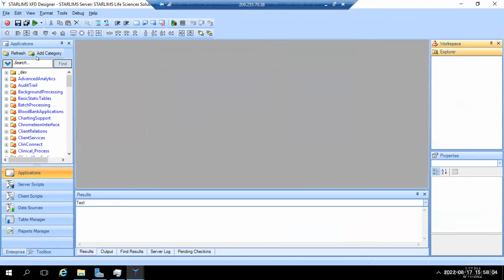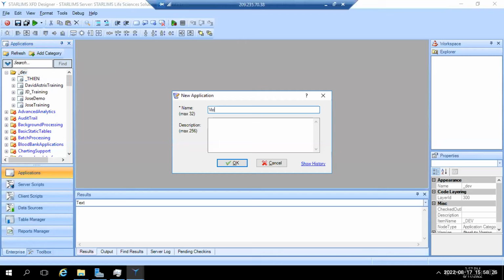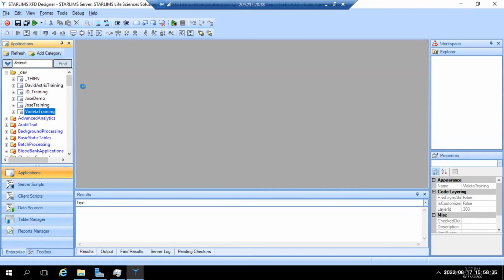with Carlos. Okay, so we have here Jose demo, Jose training, and Jordan, where are you? I don't see you here. Yeah, JD. My bad. JD training. Okay, so then Jose demo. We created 2 of them. So I'm going to create Violeta training. Okay, so let me go back to me.